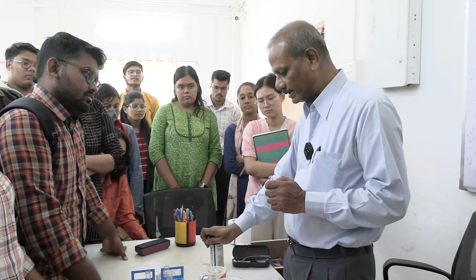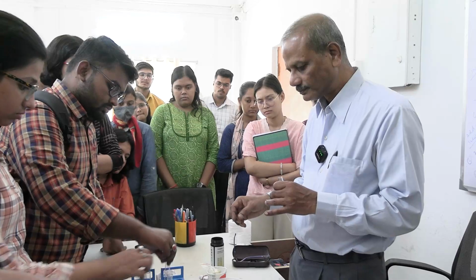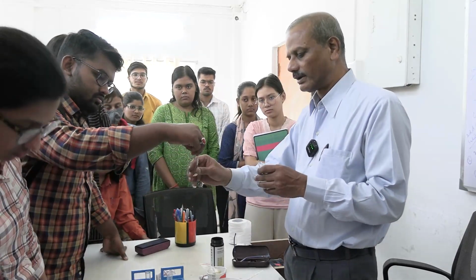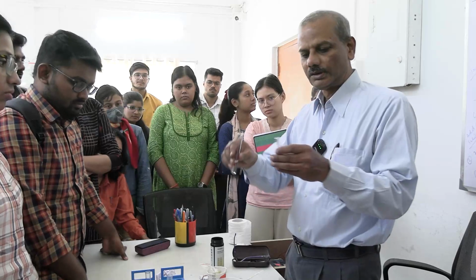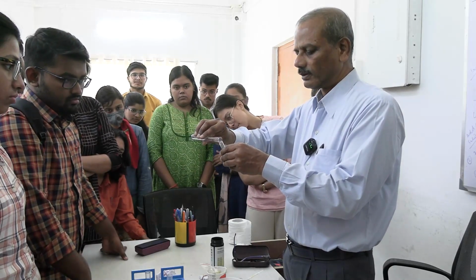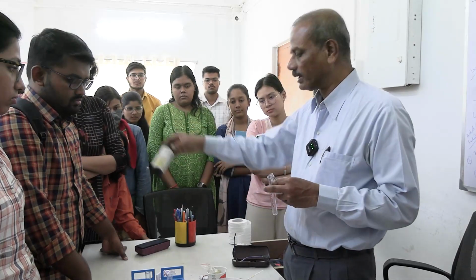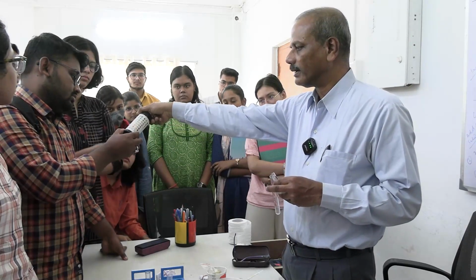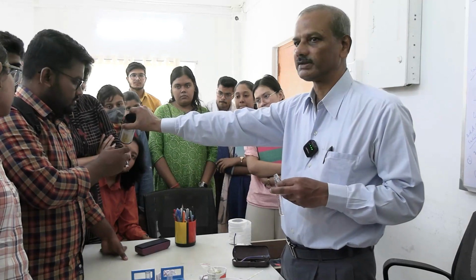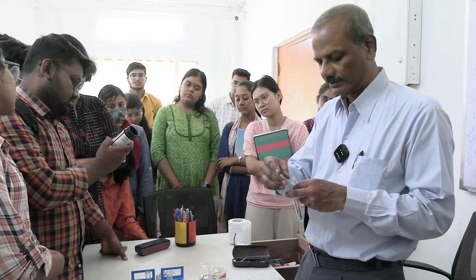Now I have prepared the glucose solution yesterday. I have taken a small amount of glucose, and this I have prepared today. All of you, first and foremost, have a look at it. You see that glucose is there, 4+, 3+, whatever I have said in the literature, the same thing is written here.